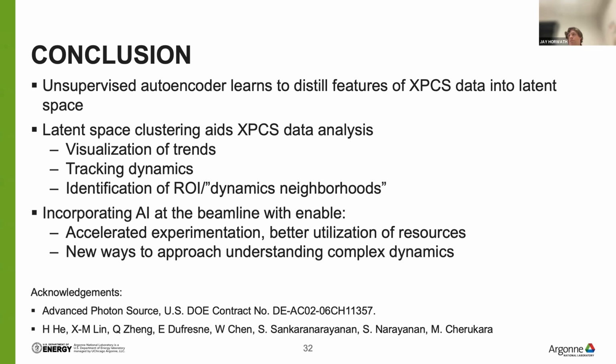Sure. So at this point, I'm still just getting started with combining the simulations effort here. But the benefit is that if we can have some sort of finer scale microstructure simulation that we can compare to that dynamics and do sort of a computational XPCS, then we might be able to look at the structure, analyze these simulations, and figure out what each of these complex patterns mean. Before we get into the actual experiment, we'll have a better idea of maybe what's happening in the microstructure. So that would be the best thing to do, because without a way to track particles, to track the structure, there's no way that we can figure out what this crazy thing that sort of looks like a bird is meaning, right?